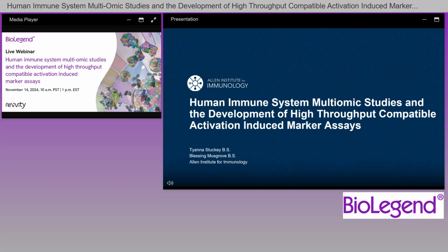Hi everyone, my name is Tyanna Stuckey, and I'm a researcher at the Allen Institute for Immunology, and I'd like to thank you for joining us today. Today I'm going to talk about the human immune system multi-omic studies that we've developed here at the Institute and how we're transitioning from doing those high parameter studies to the development of high throughput compatible activation-induced markers using lower parameter instruments and assays.